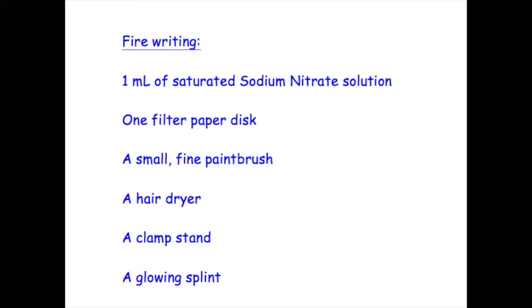We need one milliliter of saturated sodium nitrate solution, one filter paper disc, a small fine paintbrush, a hairdryer, a clamp stand, and a glowing splint.